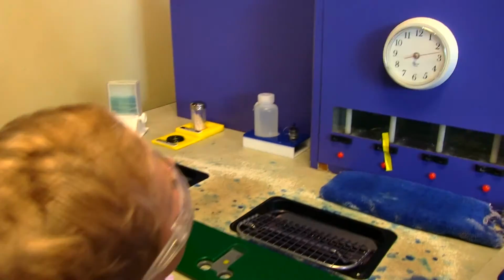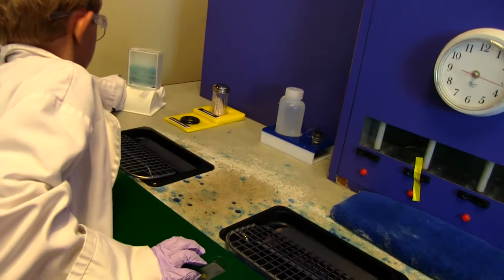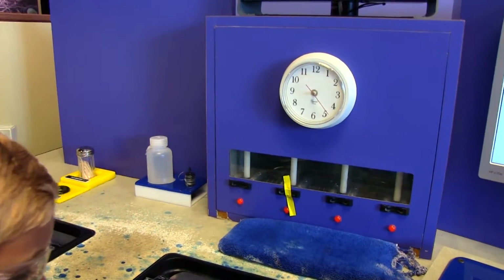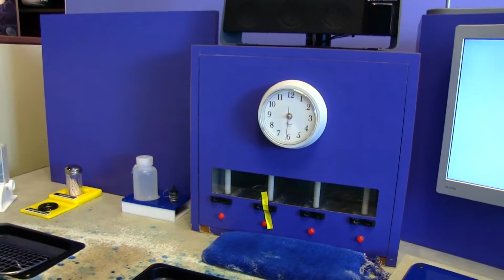Get a clean slide from the dispenser. Turn either side knob and a slide is ejected. Got one. Yep. What do I do with it? Place the slide into the slide holder cartridge with the frosted side facing up. What does it look like? This?